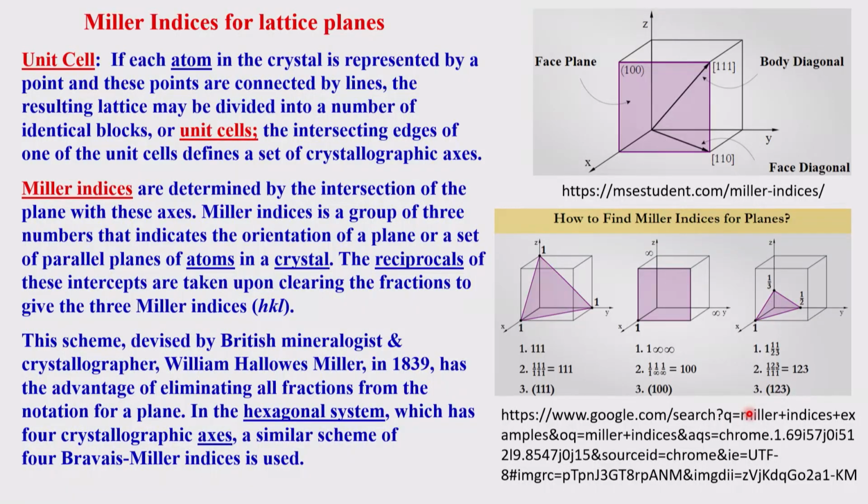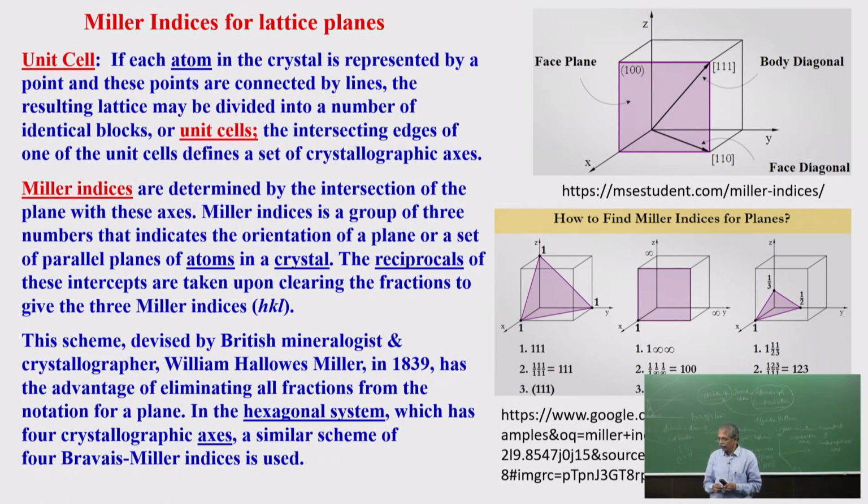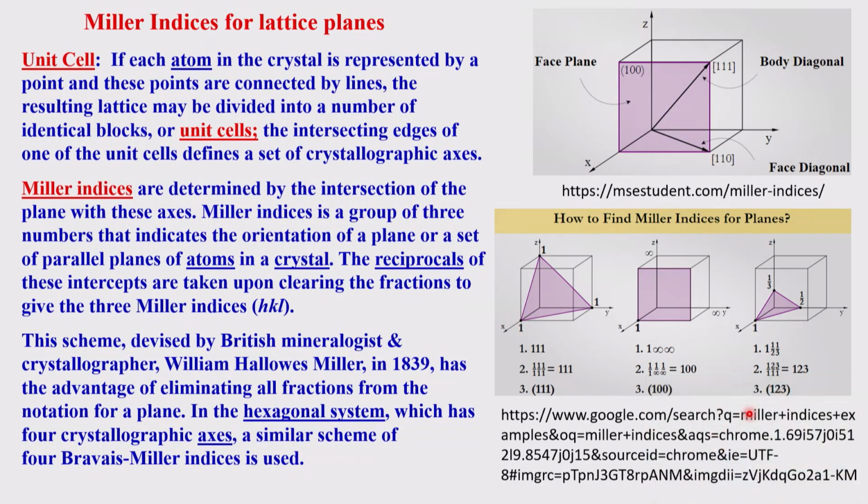So, what is it that we learned? We learned that we can look at the planes containing atoms, atoms containing electrons. Therefore, the planes will diffract. In general we use the phrase that the plane is diffracting. It is not actually the plane which is diffracting, it is the atoms which scatter, and the scattered radiation overlaps, and then the diffraction comes in. So this is used as the HKL.